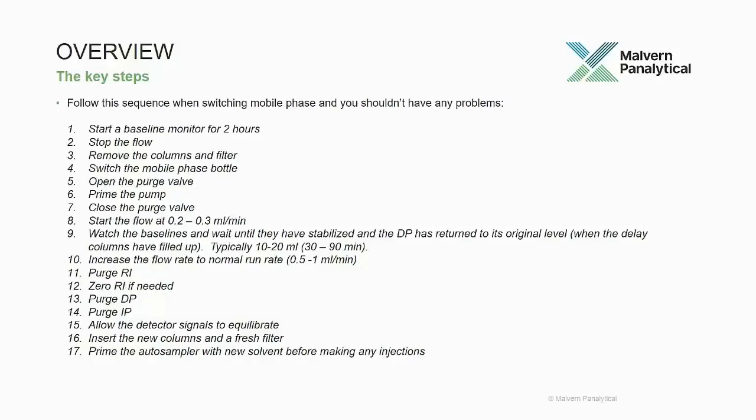Now, one final point to make here is that this process is going to take at least an hour, more likely 2 hours for every mobile phase switch. So be prepared to take your time and keep an eye on the system and watch the whole process through. Now, in the video we're going to show a longer demonstration of this, showing the exact process with a lot more detail, but as a summary, this should cover the steps.